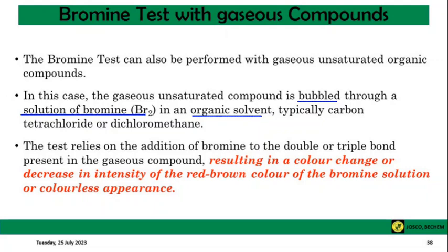Remember the organic solvent that we used in the water-insoluble compound? Yes, that is the carbon tetrachloride. This is the organic compound that would be used, carbon tetrachloride.